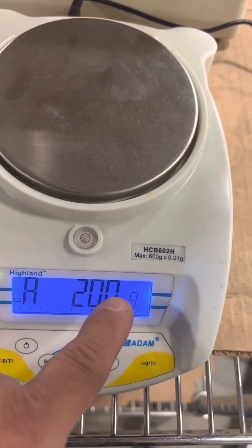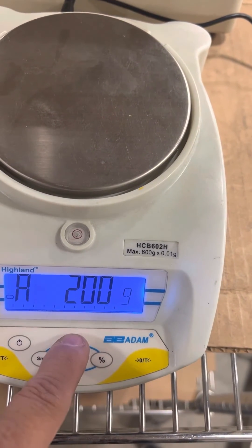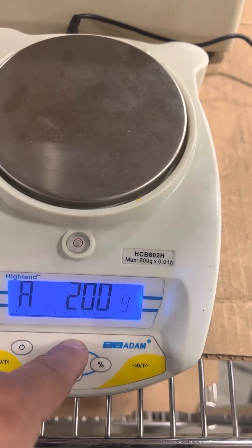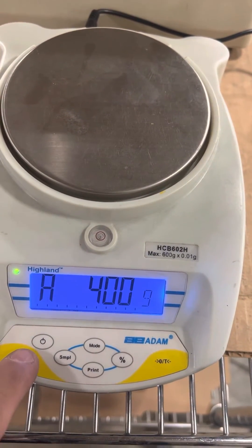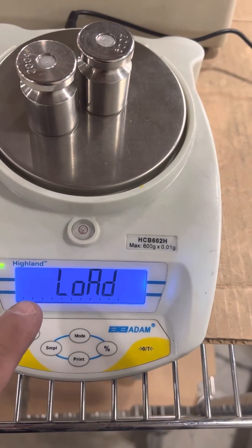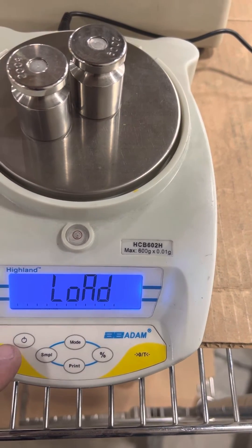It says add 200. You could change that by pressing the mode to 400, 600 — let's go with 400. Press tear, it says load. Load your weight, wait for that stable little display to come on, and then press tear.